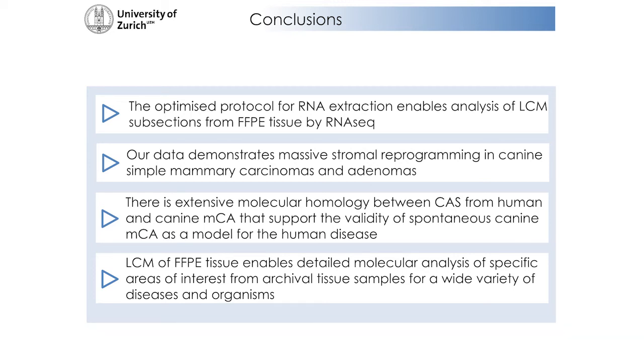And importantly, laser capture microdissection of FFPE tissue enables detailed molecular analysis of specific areas of interest from any archival tissue samples of a wide variety of diseases and organisms.